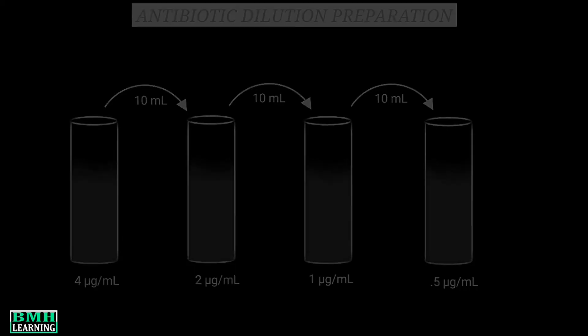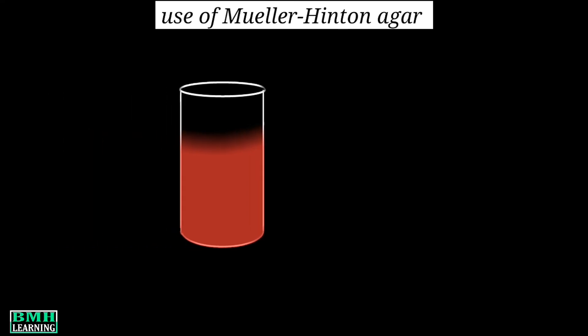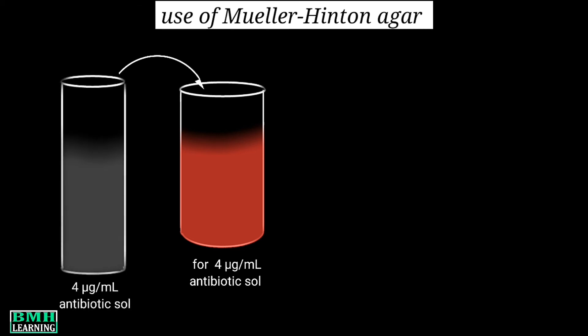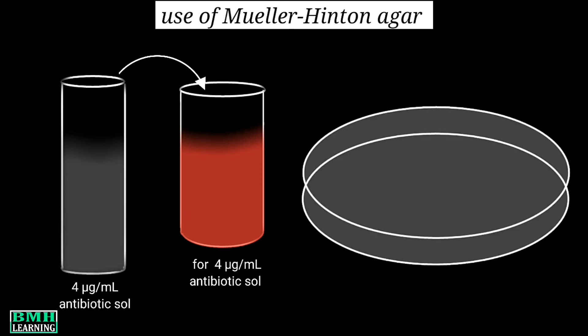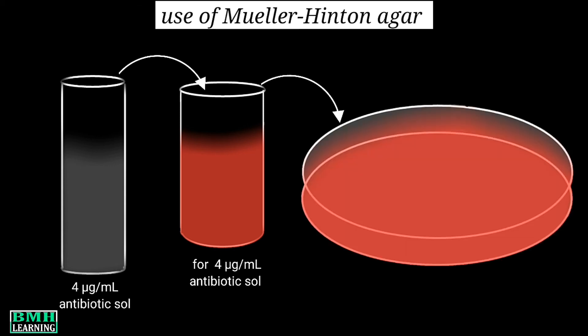Now it is time to use Mueller-Hinton Agar. For each concentration — for example, 4 micrograms per ml — we add the corresponding antibiotic solution into the melted Mueller-Hinton Agar. The agar with antibiotic is then poured into a Petri dish. This process is repeated for each serially diluted concentration. After completing all plates, we allow them to solidify.